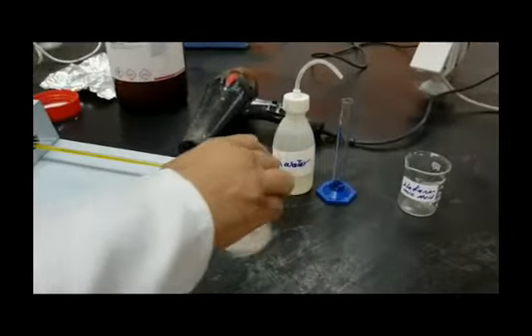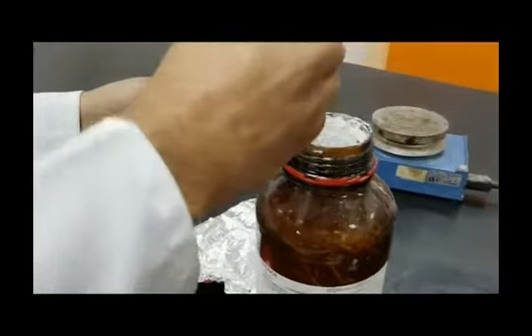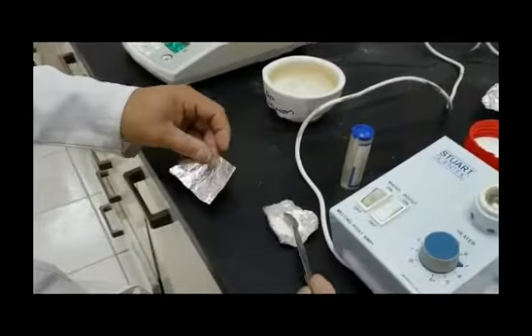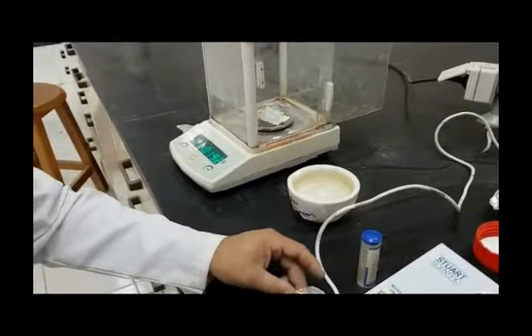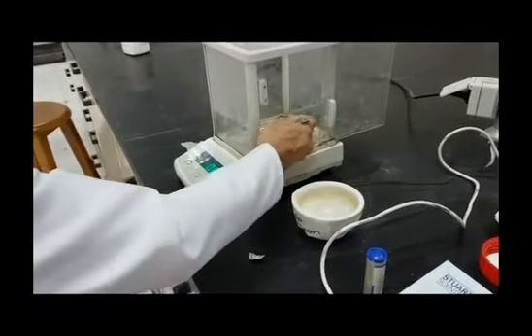To test the aqueous solubility of mefenamic acid, please weigh 100 milligrams of the acid. Then place the measured quantity in a labeled beaker as we did with the salt.